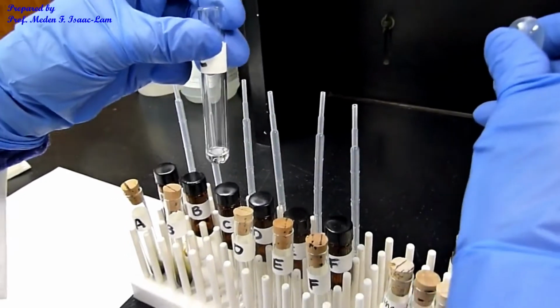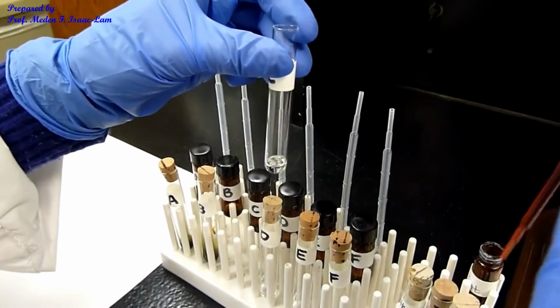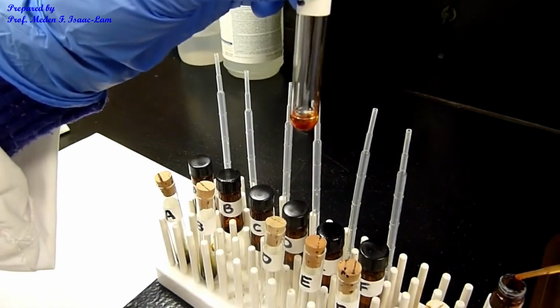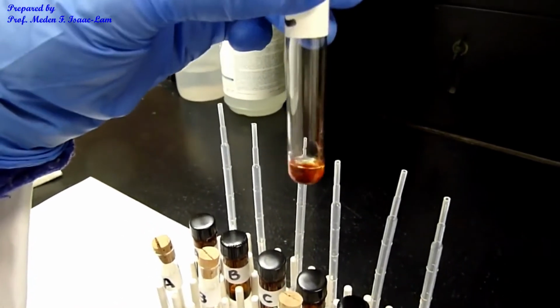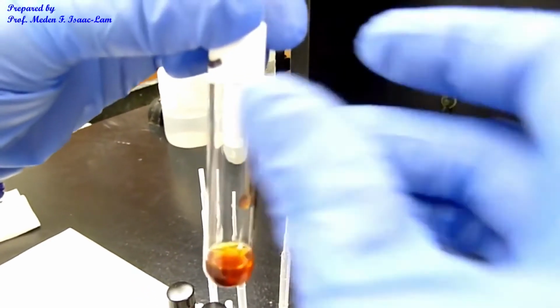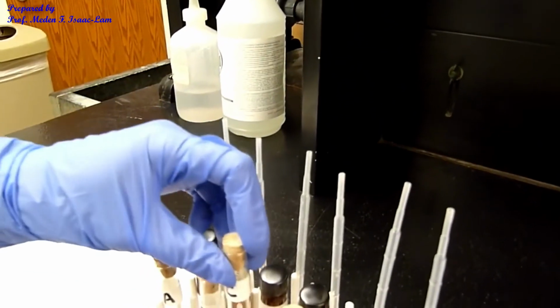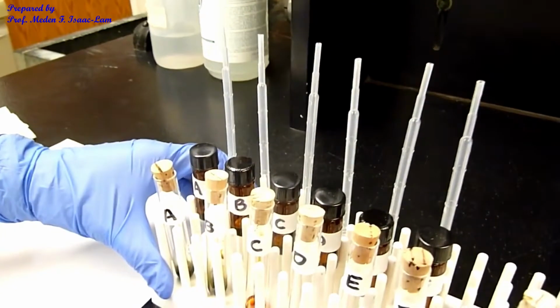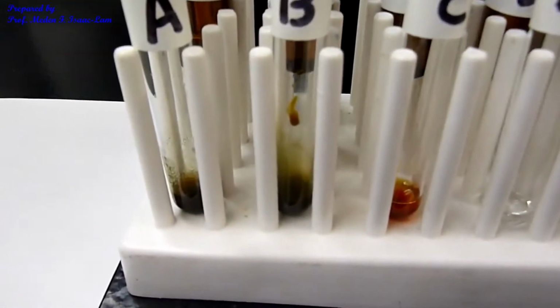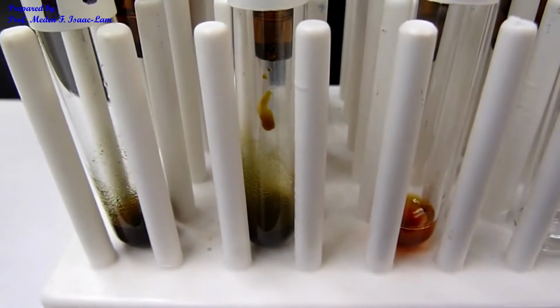We're gonna add 2 drops. So it's intensely orange in color and no reaction. So we let it sit, but if you compare A, B, C, you can see that C is orange. A and B reacted, C did not react.